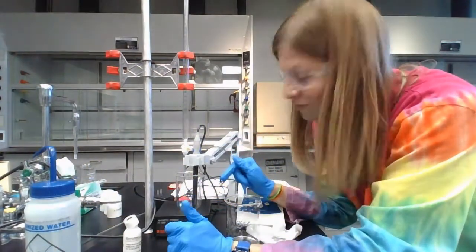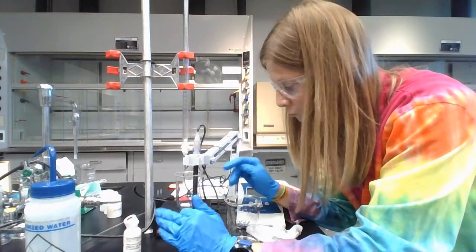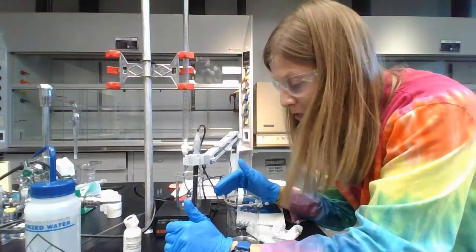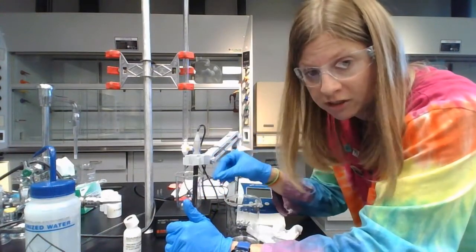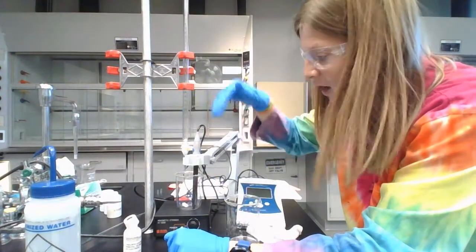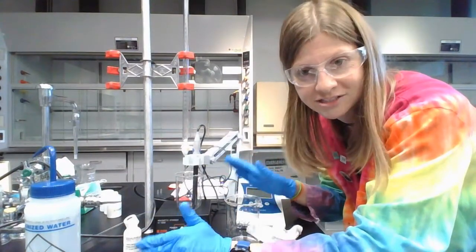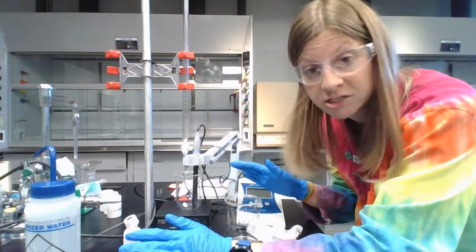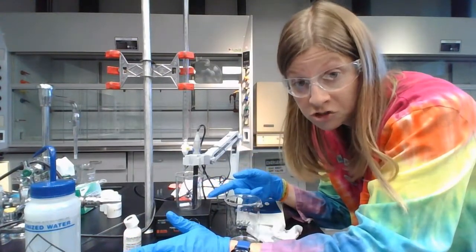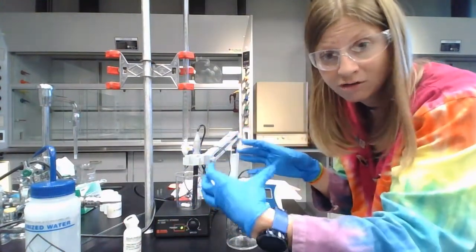So what we have here is we've got a lot of stuff going on. We've got a stir bar spinning, and that stir bar cannot be running into anything. You don't let it hit the sides of the beaker. Don't let it hit the pH meter. So you have your pH meter submerged in there. You're also going to have your burette that's able to add liquid, and nothing is blocking that. So you're going to have to kind of find the sweet spot for all of these to figure out how to get this arranged. It's totally possible. I'm using the 150 milliliter beaker, which is the smaller of the two beakers, and I got it arranged. If you're using a 250 milliliter beaker, you have a little bit more space.